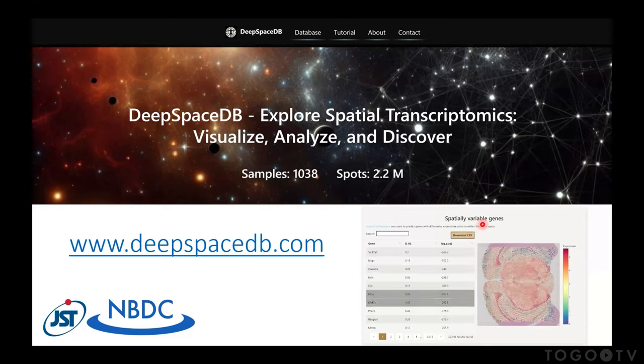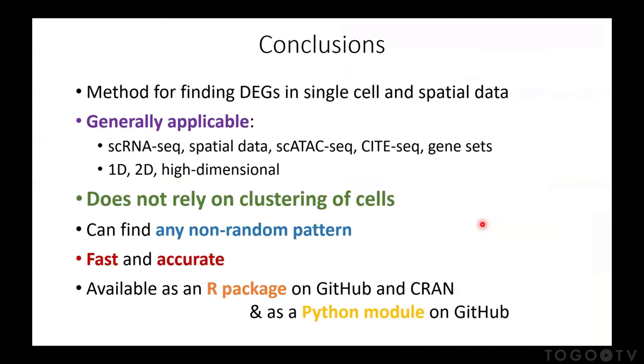Is there any functional difference between the R package and the Python package? I should say, unfortunately, I was not so involved with the Python one, but as far as I know, he's trying to really get them to return identical results, or more or less. It's hard to do because there's a random component in the shuffling, but they return very similar results. I think in theory, they are the same. The content should be the same. But Python is a lot faster, unfortunately or fortunately, I don't know.